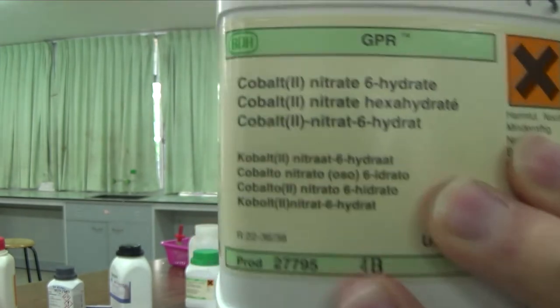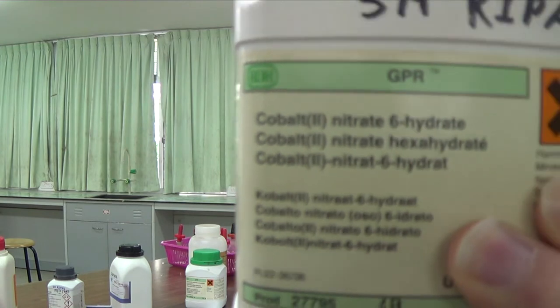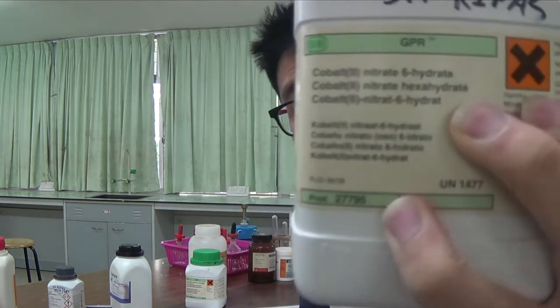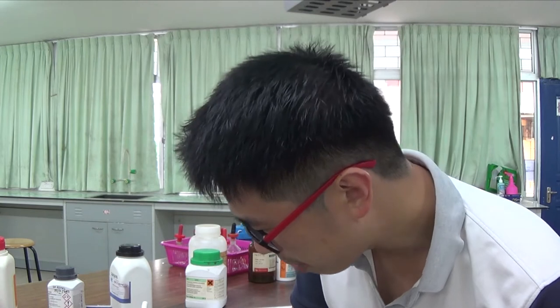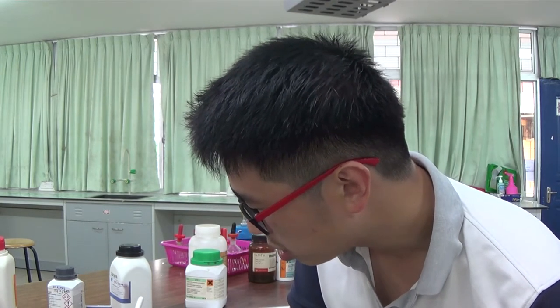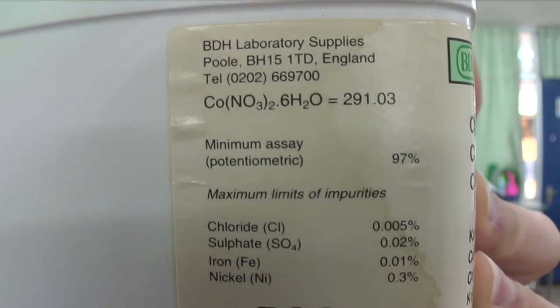This is cobalt(II) nitrate, so Co2+ and NO3-, and it's a hydrated compound. I think it's a hexahydrate, so it's .6H2O. So the formula is going to be Co2+ with NO3- and you have two of them, so it's Co(NO3)2, and then .6H2O, such as the formula here. Okay, and then the molecular mass is given there.